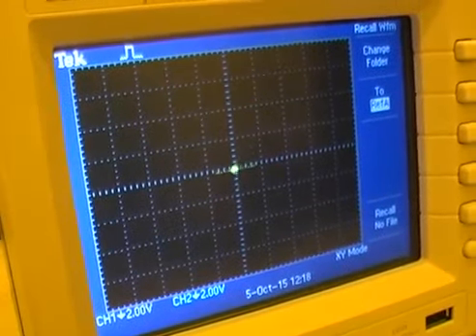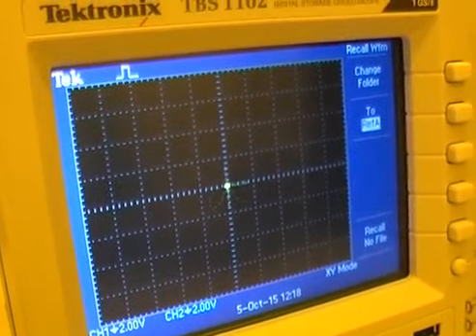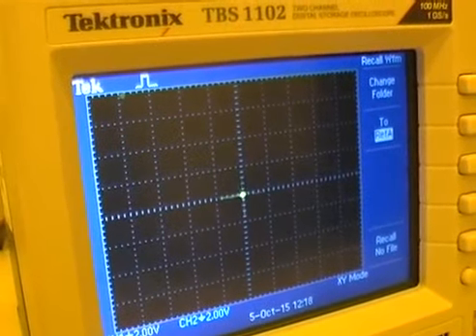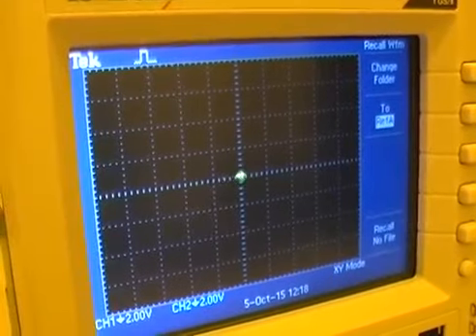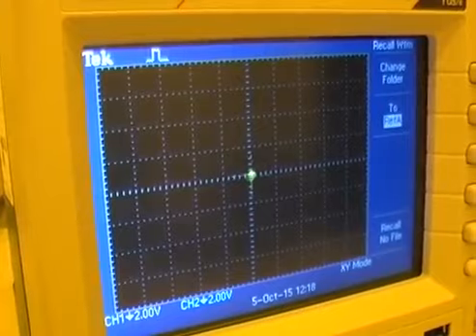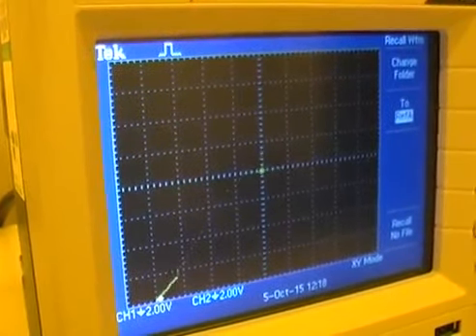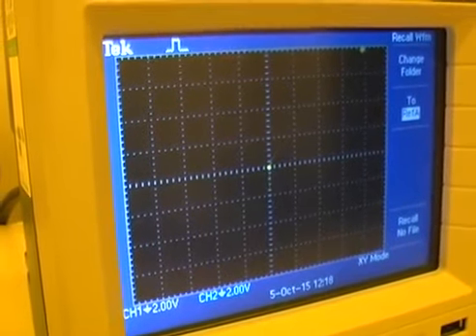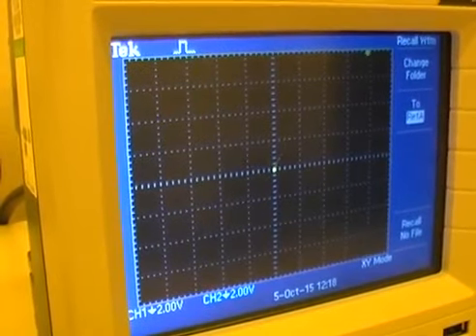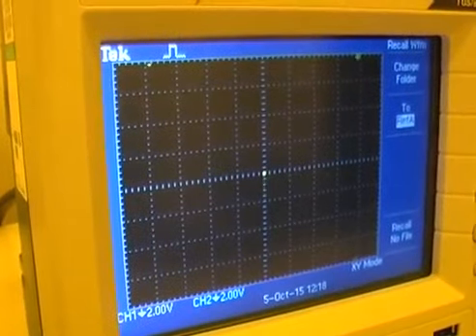And what it's doing is it's moving the stage by, say, half a field in X and Y. So you've got a 1 millimeter field. It will move the stage by 500 microns, and then find the marker by deflecting the beam. And that's why the beam appears to be in the corner of the field, as you can see here. And that way it can calibrate the size of the field against the distances moved by the stage.